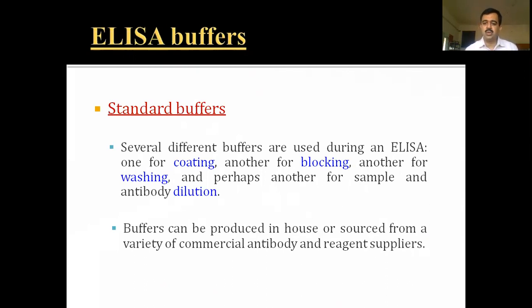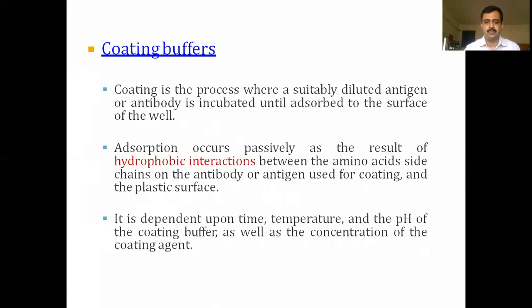Buffers can be produced in-house or sourced from a variety of commercial antibody and reagent suppliers. Of course, in an ELISA kit, the buffers are easily available, manufactured by different companies, and they are helpful for analysis through ELISA.